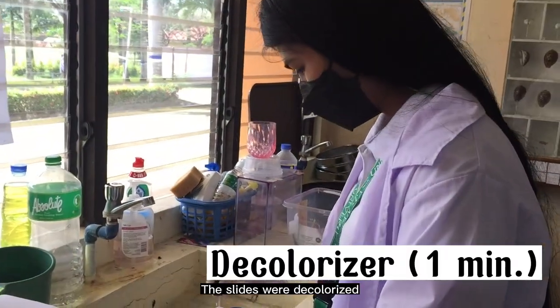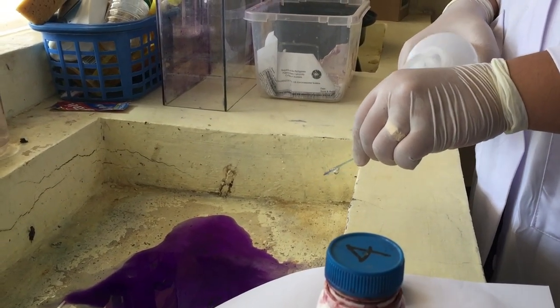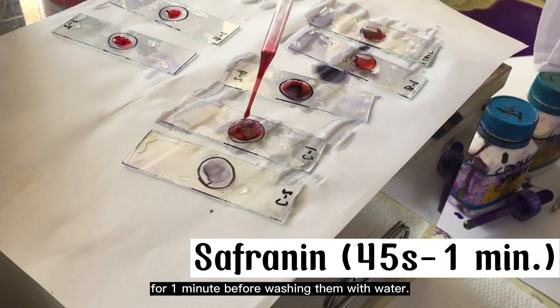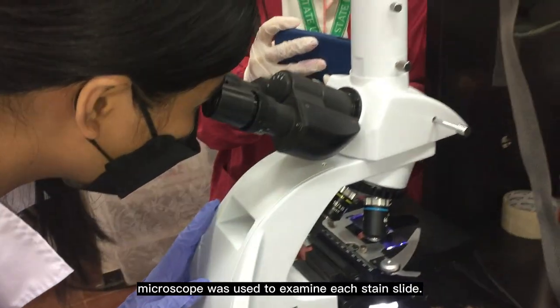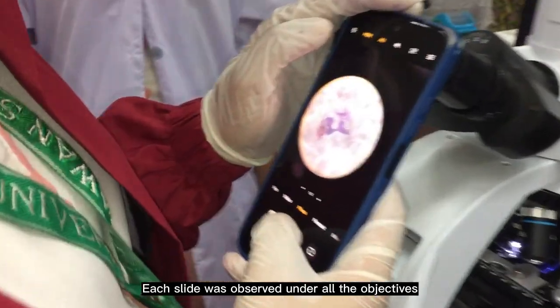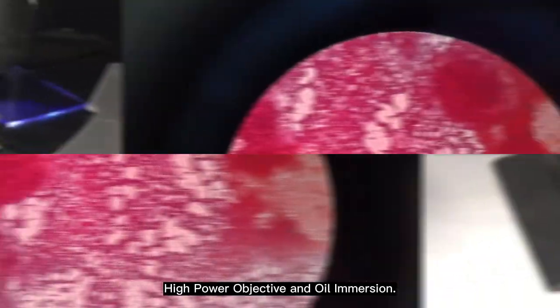The slides were decolorized until all stains were washed away. Then, they were washed again with water. After safranin was dropped on each slide, they were soaked for 1 minute before washing them with water. A light compound microscope was used to examine each stained slide. Each slide was observed under all the objectives including scanner, low power objective, high power objective, and oil immersion.